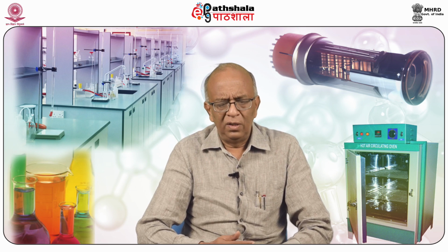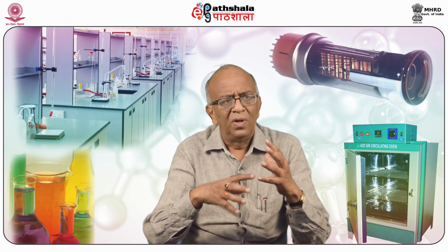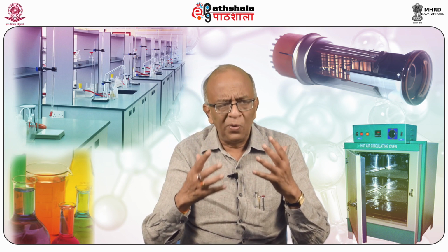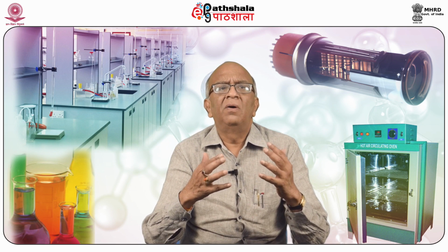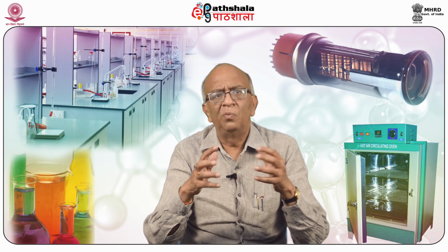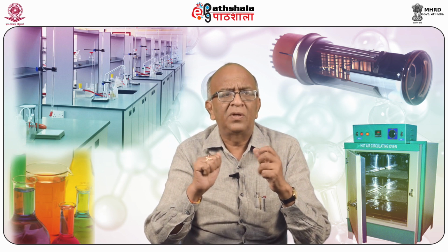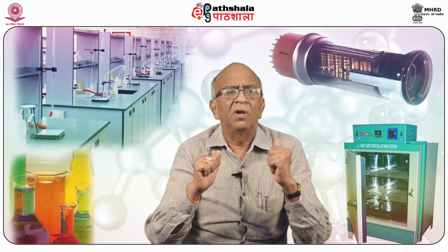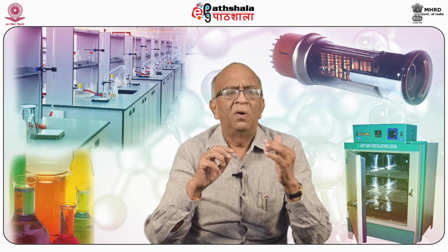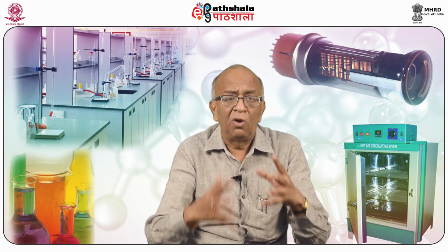So far, you have learned how to clean, how to remove impurities, maybe organic or inorganic, adhered to your glassware, how to remove impurities deposited on a beaker, on a conical flask, in a pipette, on a burette by using different types of solvents.